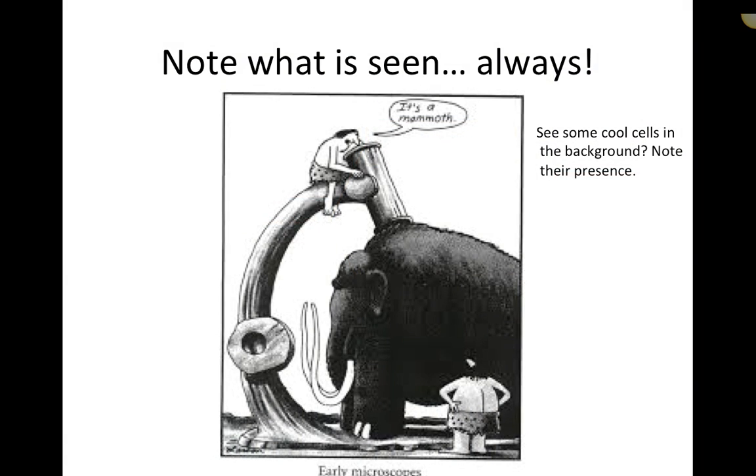Always note what's seen. So in test quizzes I'll prompt you, I'll say classify this sample, support your findings. So for fully supporting your findings, you would say, let's say it's purulent, septic, degenerate inflammation. So you've told me everything I need to know. For supporting your findings, you would say it was more than 70% neutrophils, so therefore it's purulent. White blood cells were present, that makes it inflammation. And then I said it was septic because I saw 2+ cocci.